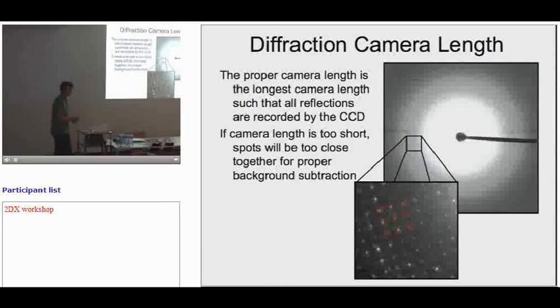For untilted images, it's not quite as much of an issue. For tilted diffraction patterns, or diffraction patterns of tilted crystals, you start to get these spots to blur. At higher and higher tilts, it gets more and more severe, depending on how flat your specimen is. If you have severe blurring, you can almost get these spots to run together. So you want to make sure you have nice spacing between them so you can still subtract the background, even if your spots start to elongate.